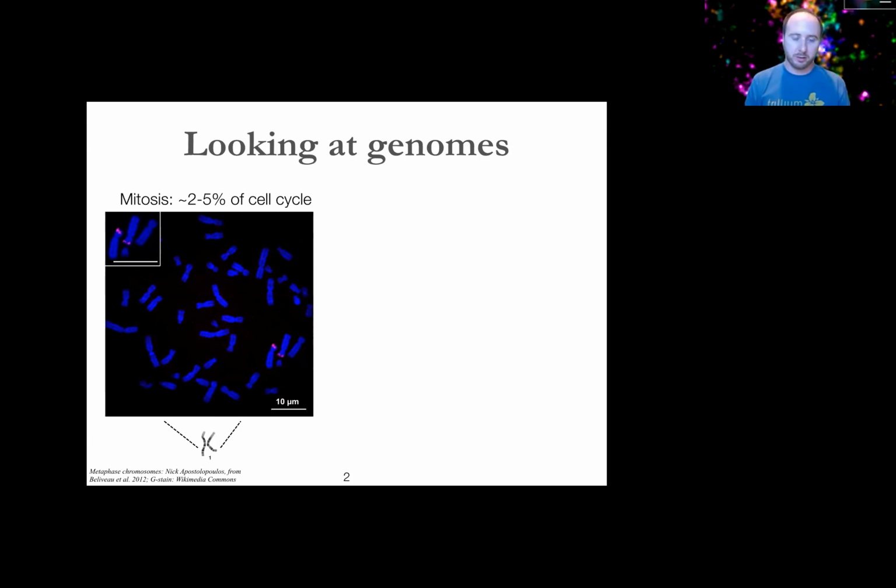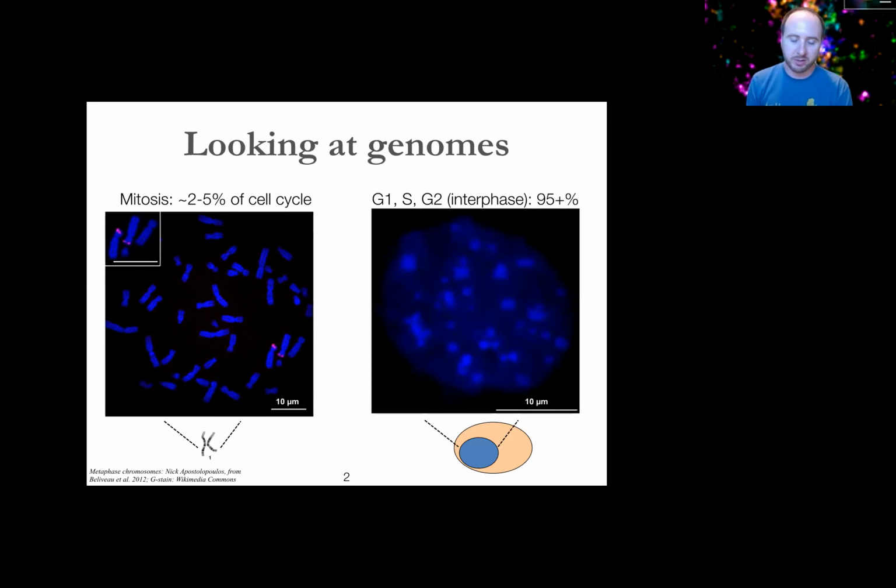And if we wanted to learn something about the genome in terms of how the linear DNA is organized into chromosomes, or how many chromosomes there might be, it's reasonably straightforward to do it from this kind of image. But of course, in biology, this is an ideal case, because if we were to take something like an asynchronous culture of cells growing in TC and fix them and stain them with something like an intercalating dye, like the DAPI image I'm showing you here, we see a much different picture like you're seeing on the right. So this is this kind of smeary punctate mess that is the interphase nucleus.